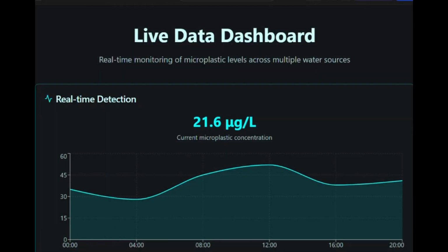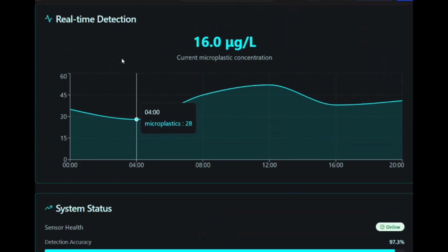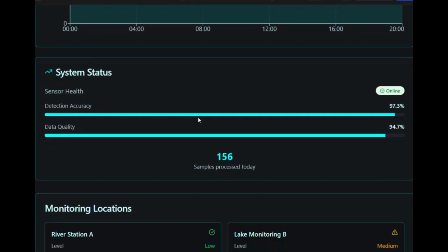The microcontroller sends the data. On the server, our website shows real-time detection of microplastics. Our live data is presented in the form of graphs and charts for simplified understanding. Not only do they show the concentration of the particles in the sample but also calculate the possible concentration in a larger body of the same sample. As you can see here, it is representing the data collected from the ML model.